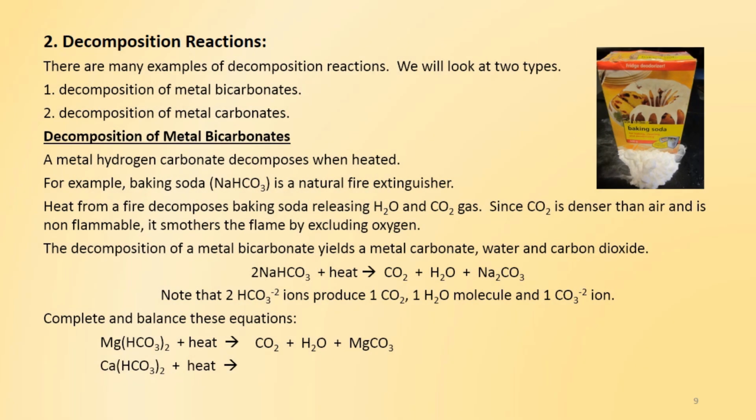How about calcium bicarbonate? When heated, it decomposes, producing carbon dioxide and water, and the metal carbonate, in this case, calcium carbonate. And since calcium and magnesium are in the same group, they both have a charge of +2, it balances the same as the magnesium bicarbonate decomposition.